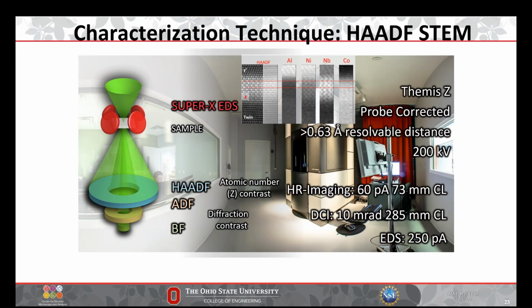The second reason is physical. If you tilt something with some given thickness, like you could even take your phone and look at it, if you were to put an electron beam through a zero tilt sample of thickness 50 nanometers, it will effectively increase the thickness if you were to alpha tilt to, say, 20 degrees, because the path the electron beam is taking is now longer through the sample.